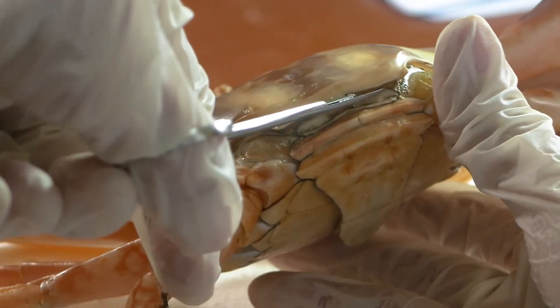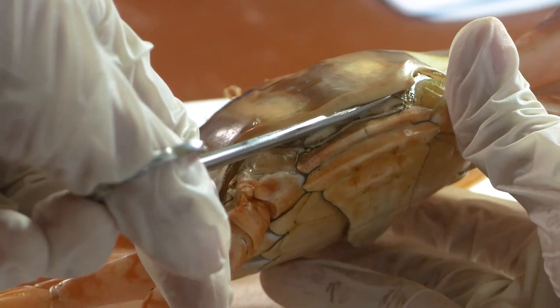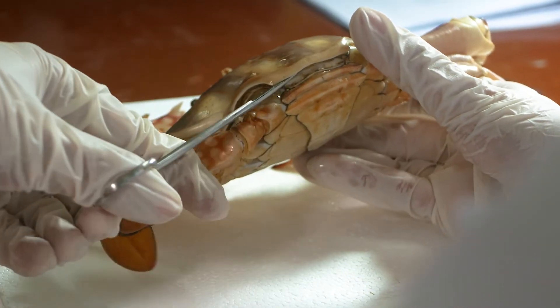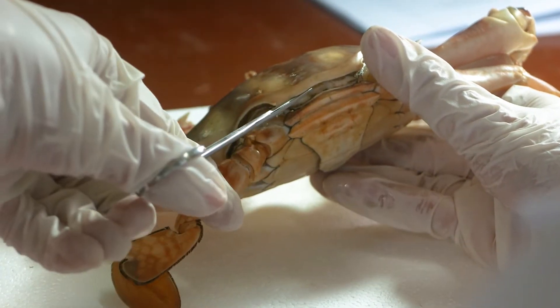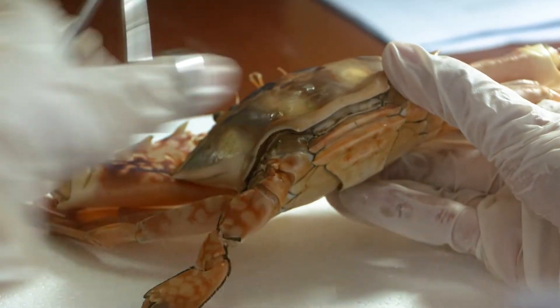Using a soft probe, gently lift up the posterior end, removing and scraping the inner surface, removing the soft tissues attached to the dorsal carapace of the cephalothorax.